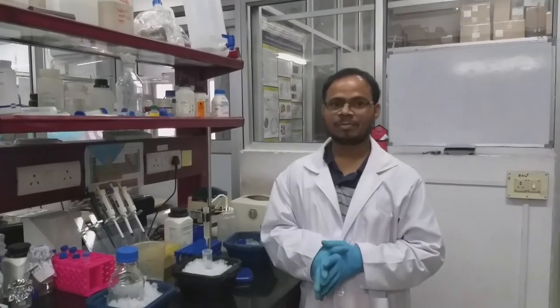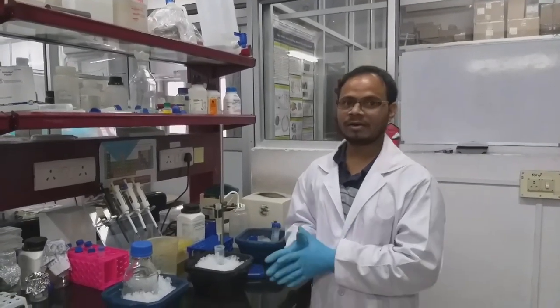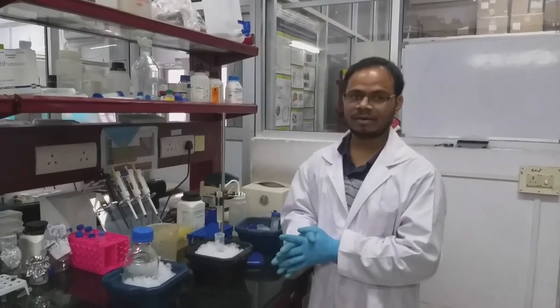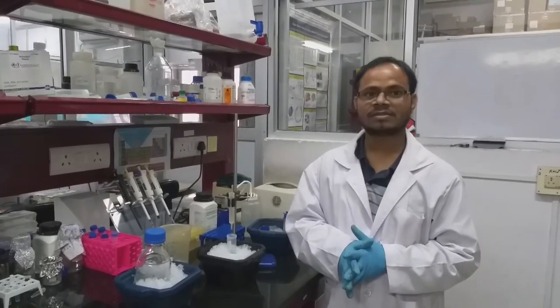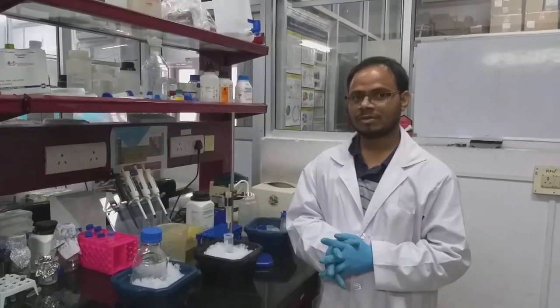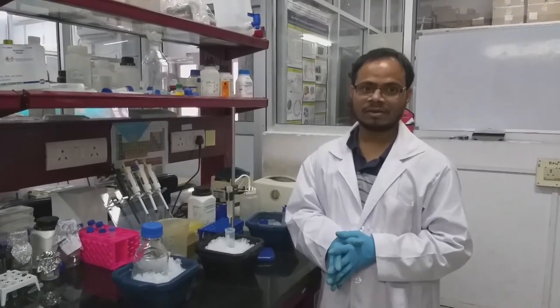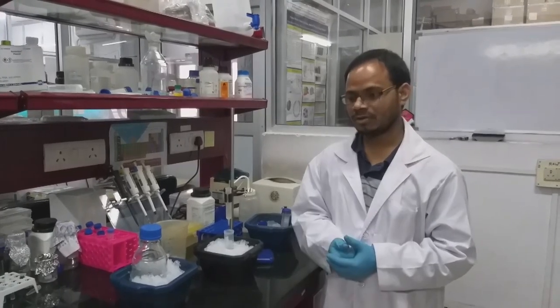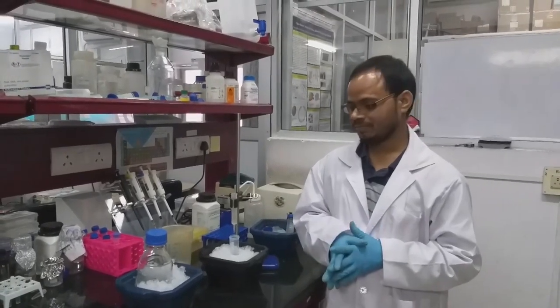For all these buffers, the pH should be adjusted beforehand. It is not that you first take the lysis buffer and then add imidazole, because it may increase the pH of the buffer. So after combining the lysis buffer with the imidazole, then we have to adjust the pH so that throughout the procedure the pH won't change.